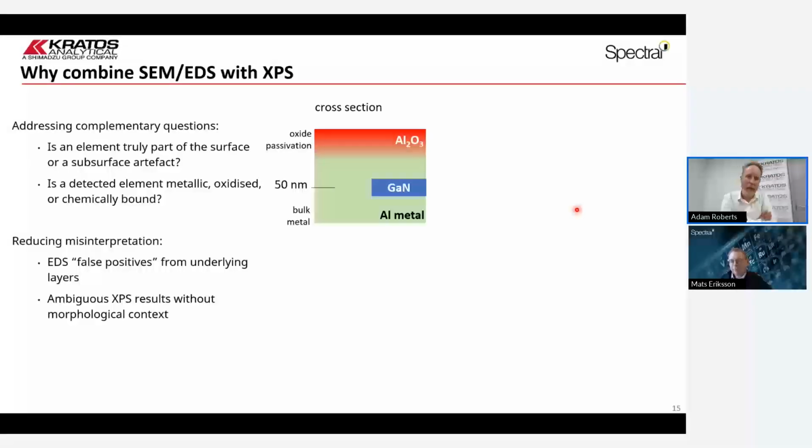So let's think about why XPS and SEM EDX are complementary. Well, if we think of the information we're getting from XPS, we can begin to ask questions: is the element truly part of the surface, or are we seeing a subsurface artifact?